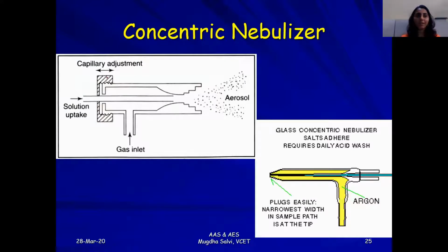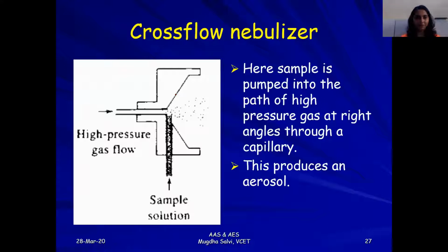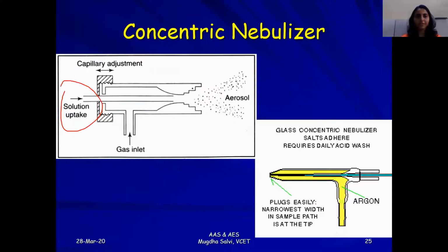In this, you have the solution uptake. Now at this very point, there is a very fine gap between the solution entry and the gas which is coming out.